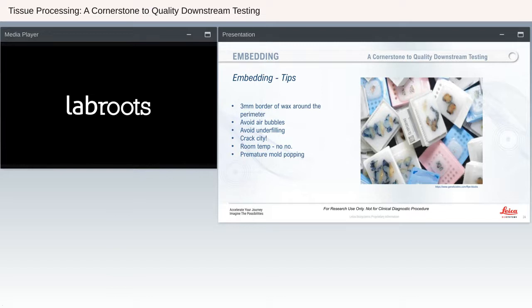Always want to make sure when you're finishing up your embedding and putting those cassettes on top, try not to capture any air bubbles. Avoid underfilling, because if you can get to the top of that cassette, it gives you even more support. If it is underfilled, you risk the chance, especially with tissue that can be dense like bone or uteri, of actually popping off because it doesn't have that support on the backside.